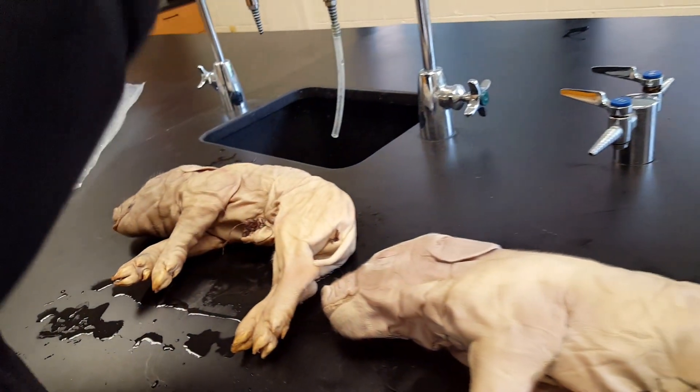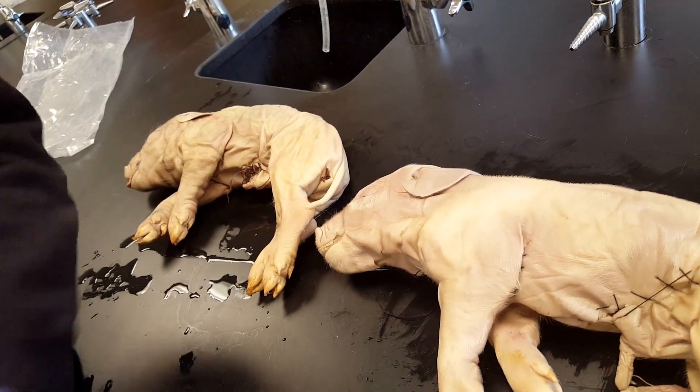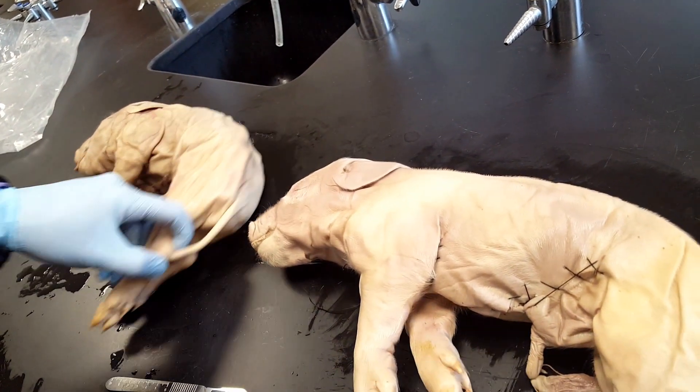We are going to dissect our pigs. First thing you're going to do is determine whether it is male or female. There are a few different ways you can do that.